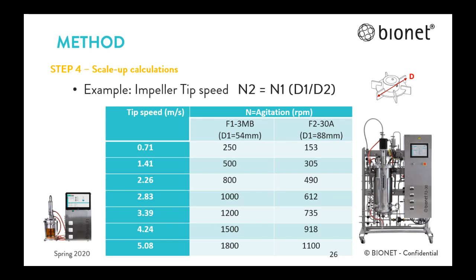However, its use entails a reduction in the power input per unit volume and in the stirrer speed, which causes a remarkable reduction of the rate of oxygen transport. Remember from step 1 the importance of knowing the behavior and use of our microorganism in the media and type of bioreactor used for production.